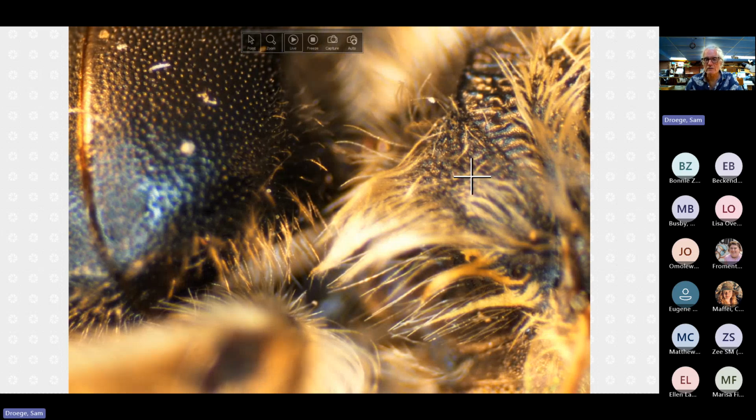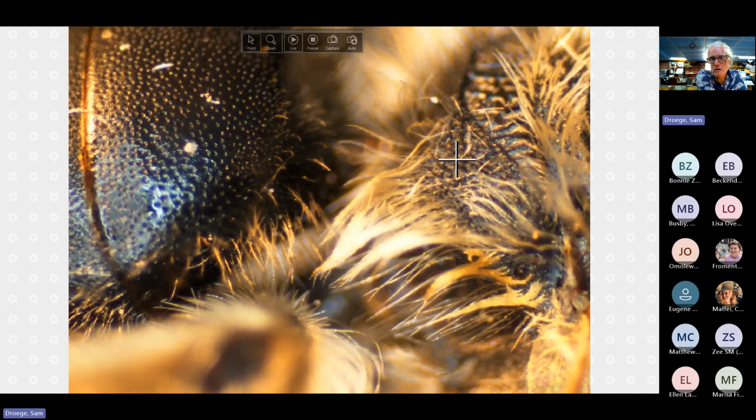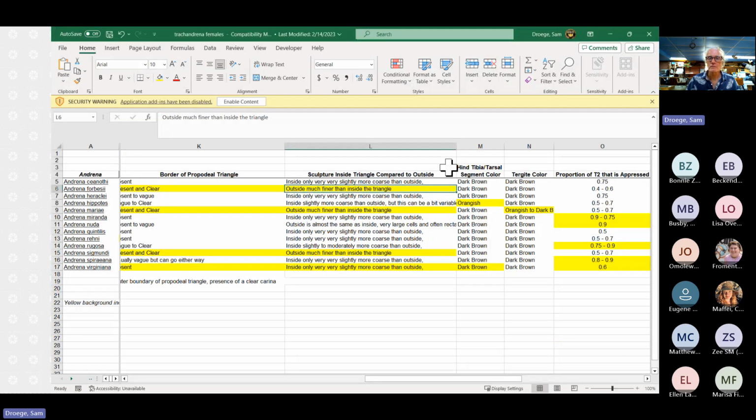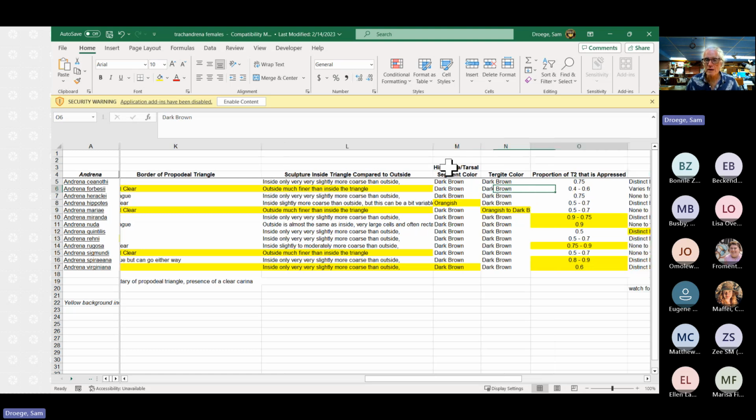First of all, there's no rectangularness. These have big gaps in between, and these are similarly rugose, we would call it. So bumpy, has elevations, topography, but at a finer level. And there's our nice crisp line. There's our edge to the tip. So I think that's pretty easy to see. We don't need to look these up. The colors of the body parts are, in this case, both dark brown.